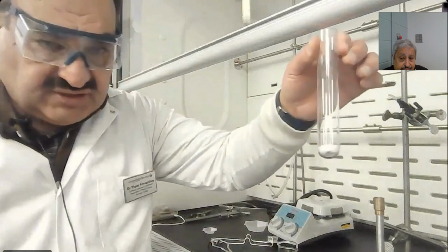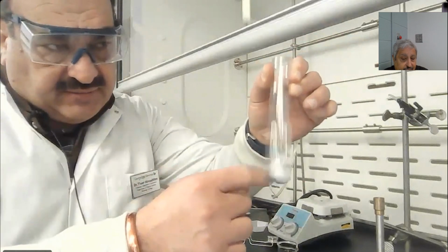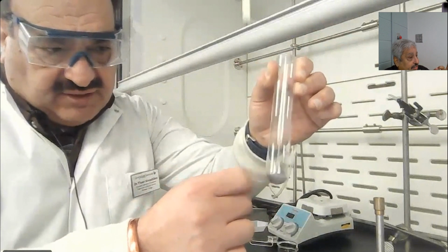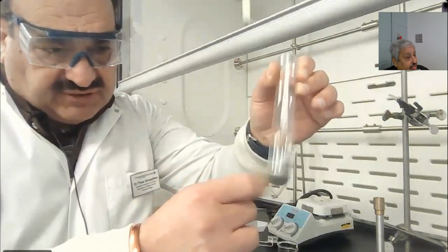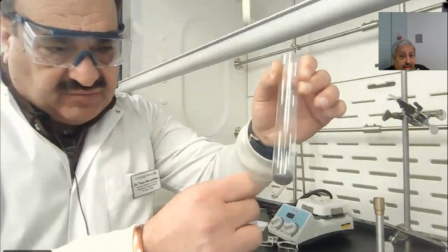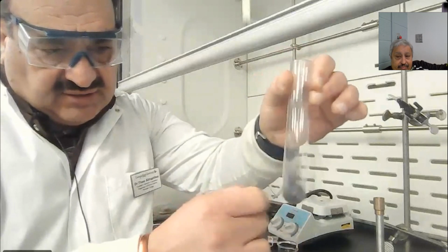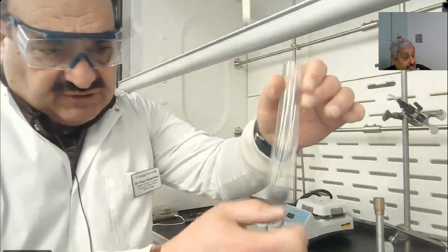When you have your whole mixture inside the test tube, try to tap the bottom of the test tube. That's another modification. We don't tap it with a finger, because of fingerprinting. So we tap it with a pencil or with the spatula. Hold the whole thing with the tissue, and then tap it with the spatula. Not with your fingerprint. Like this.